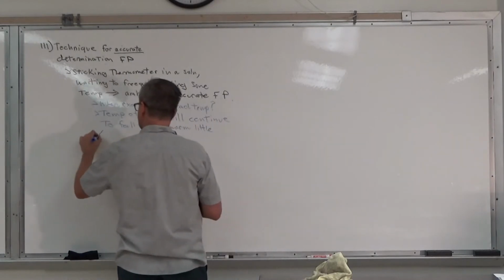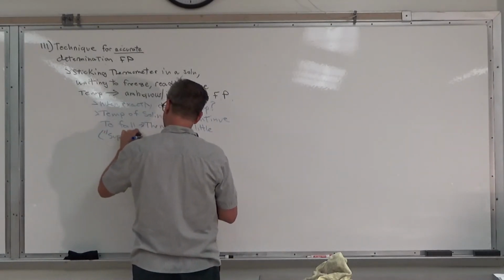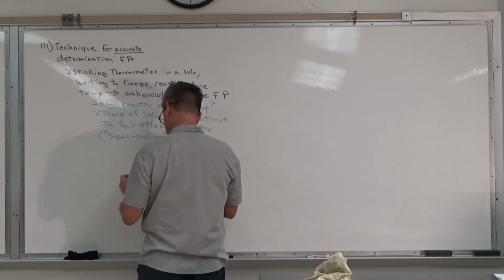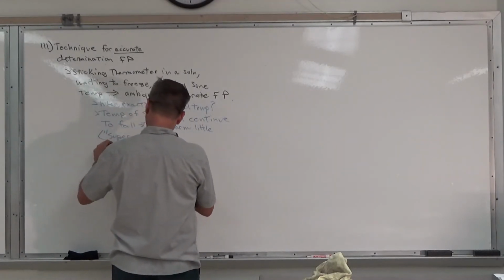This is called supercooling. And then you have some error associated with your thermometer, of course.